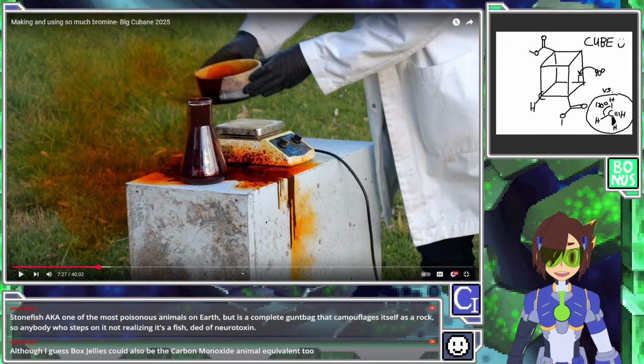Why are you trying to harvest a little bit of extra from the residue that you have left? You should have just done the math first and been like, oh yeah, I need this much bromine to react with this much aluminum. You could do that. It's not hard to do said math. It's less fun, but if you need to conserve it for what you need to do.